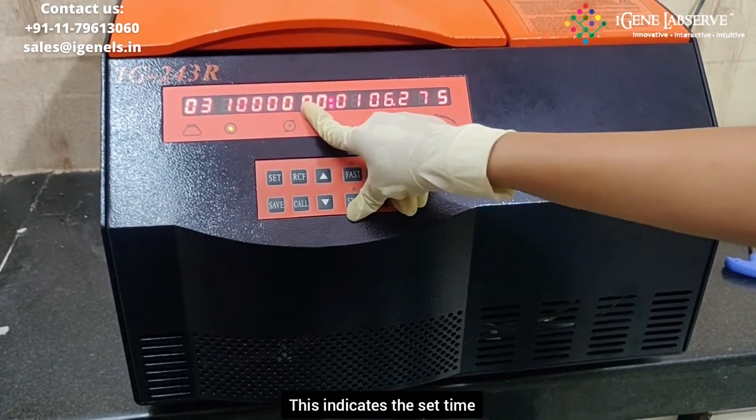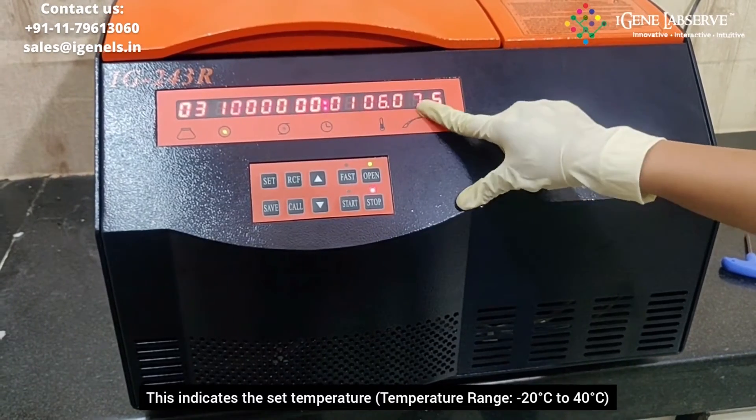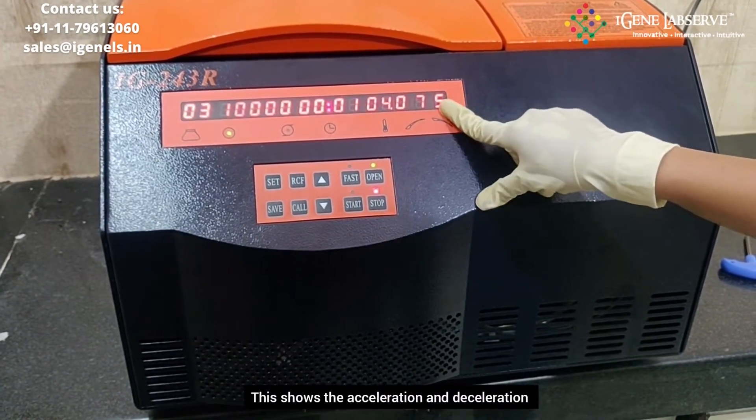This is the timer in hours and in minutes. This is the temperature. This is the acceleration. And this is the deceleration.